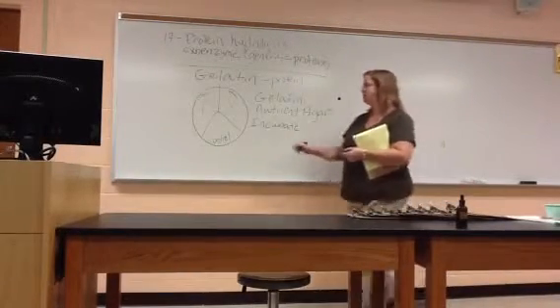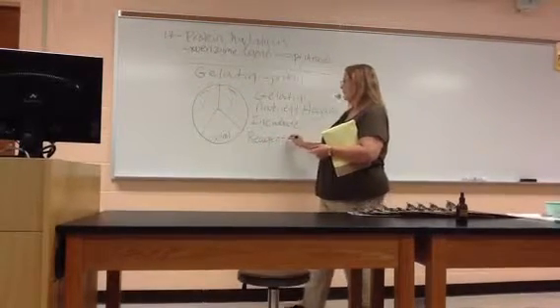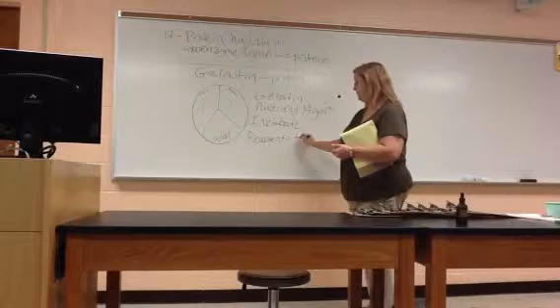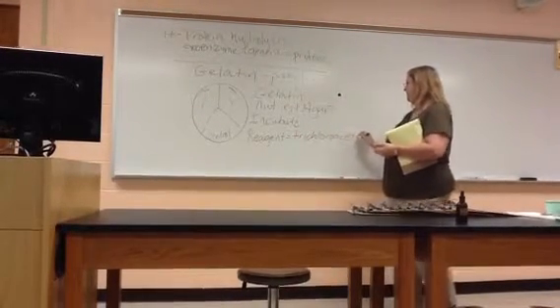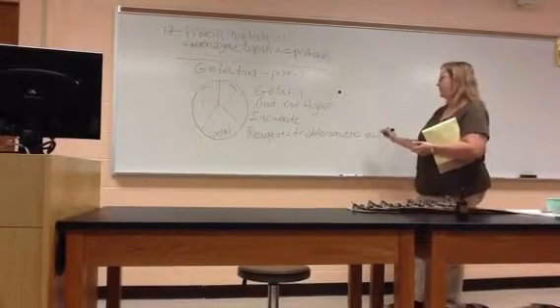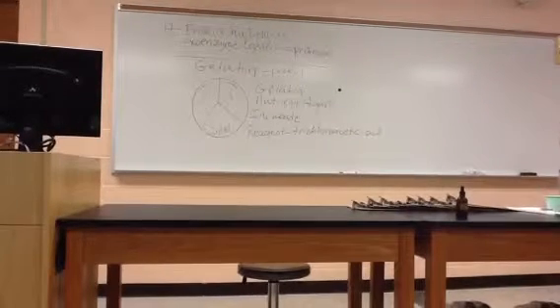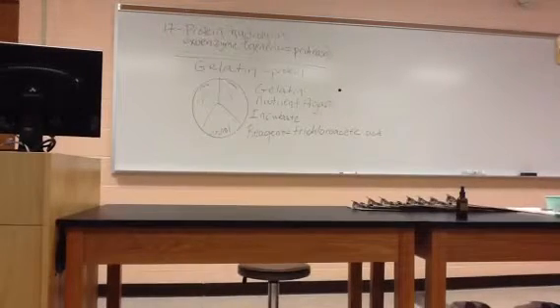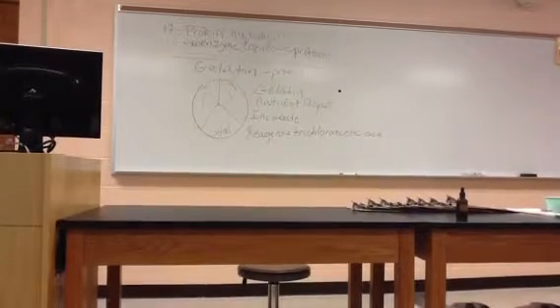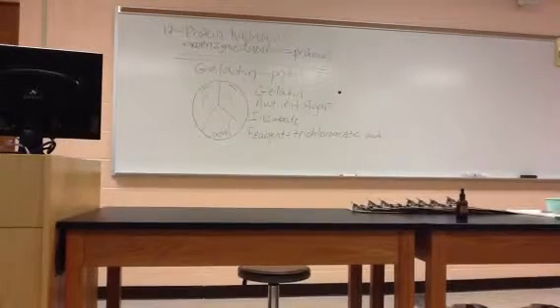We're going to have to add a reagent. And the reagent that we use is different than the one in your book. Okay? Trichloroacetic acid. This is the actual reagent that we use. Your book says to use acidified mercuric chloride. If you learn acidified mercuric chloride and you were to write that down on a test, I wouldn't mark you wrong, because that's what your book says. But we're trying to be a mercury-free institution and not use anything with mercury in it. So this is our substitute, trichloroacetic acid. And you can certainly learn that one for the quiz too and get the right answer.